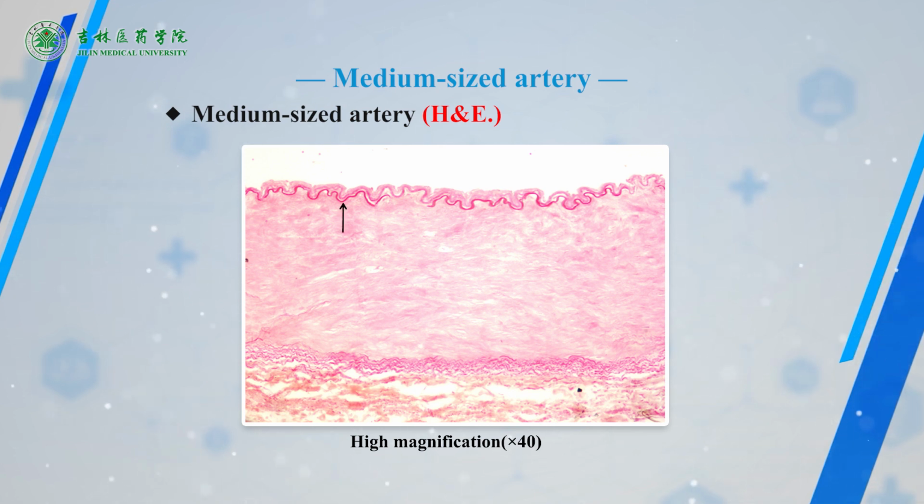The center of the artery wall is the tunica media. That's the thickest one of the three tunics, and consists of many layers of smooth muscle in circular arrangement. Some nuclei twist like a spiral because of the contraction of smooth muscle fibers. Some pink, wavy elastic fibers with high refraction can be seen between muscle fibers. Collagen fibers are lightly stained and not easy to identify.